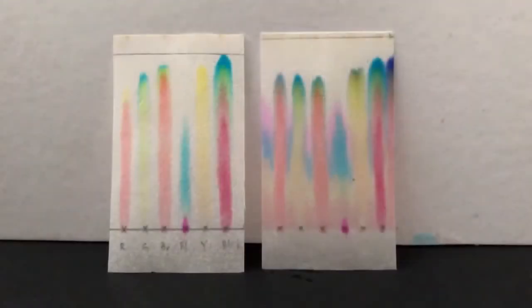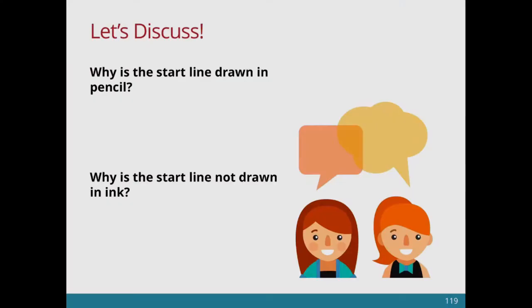We can see from the results that the ink is also soluble in the solvent and moves up along with the dyes and hence complicates our results.